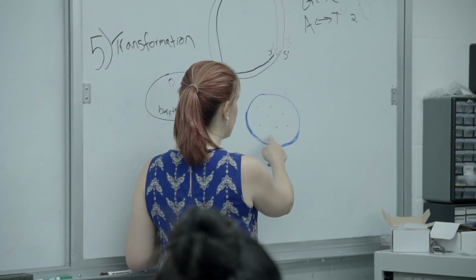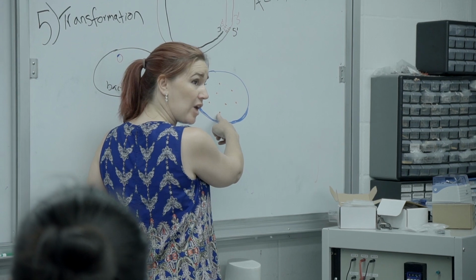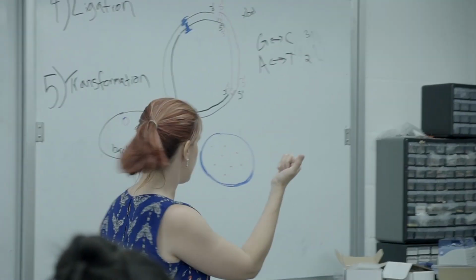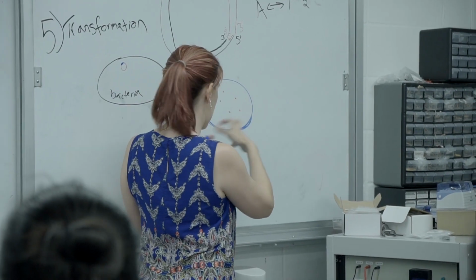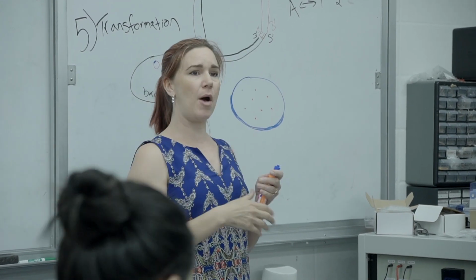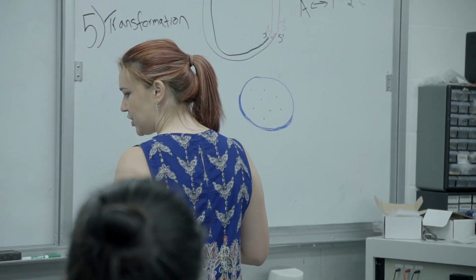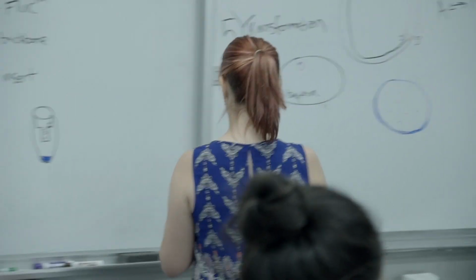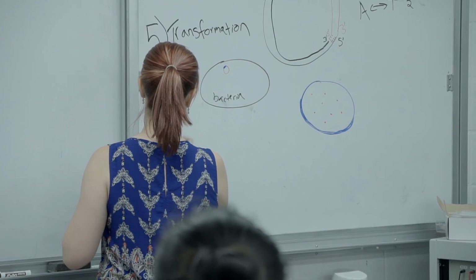And because of the way bacteria grow, and because I spread them out, this will be many, many bacteria in this tiny dot. They're all exact clones of each other, just duplicated and duplicated. So I will take a pipette tip and pick off that clone, stick it in some LB broth, and it'll grow up again overnight. And then I end up with a big tube. So number 6 is going to be, I'm going to amplify my colonies.